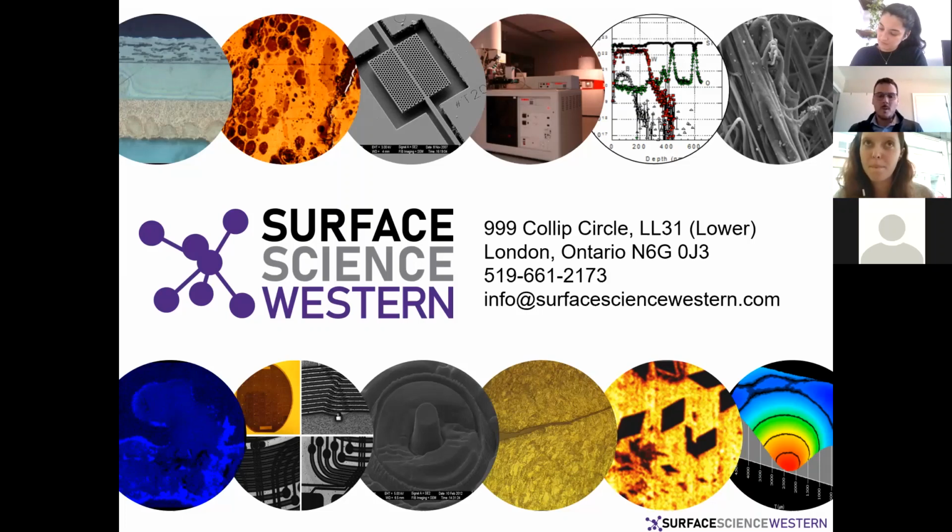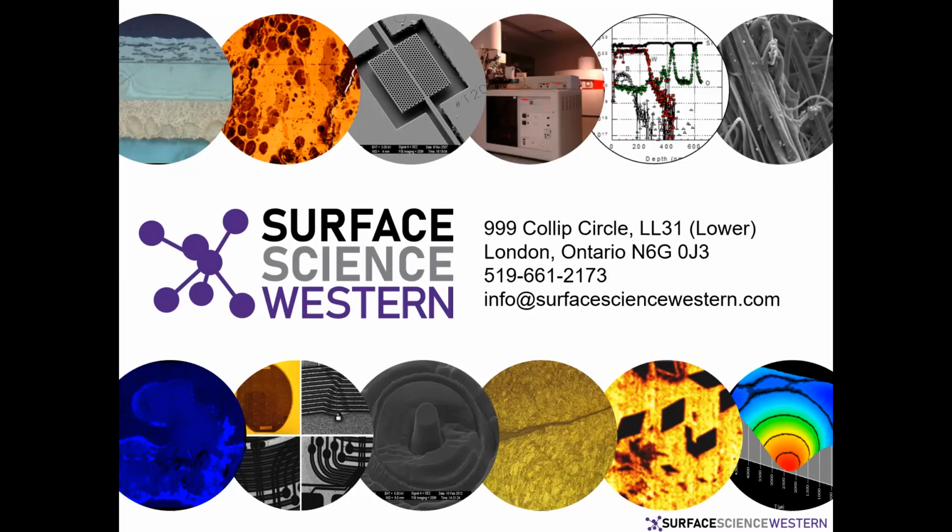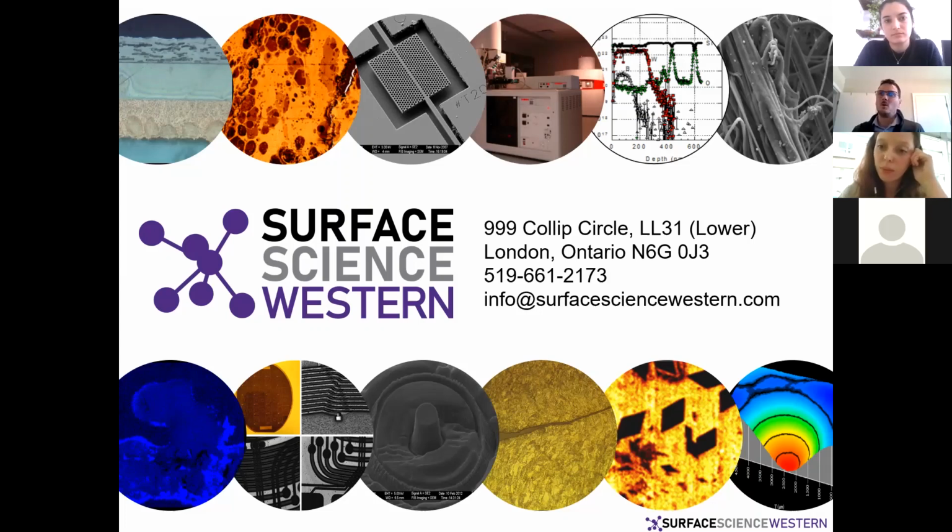Okay, so sample preparation. There is a lot of things that can go on. If you get samples that are semiconductive or insulating or partially insulating, you can get a problem called differential charging. So I electrically float a lot of my samples. I'll put them on a glass slide or on 3M double-sided tape, so they don't have electrical contact with the holder. That can eliminate a lot of the problems with what they call differential charging. I'll refer you to my website for more detail on that phenomenon.